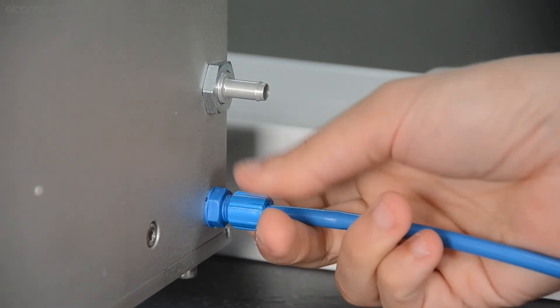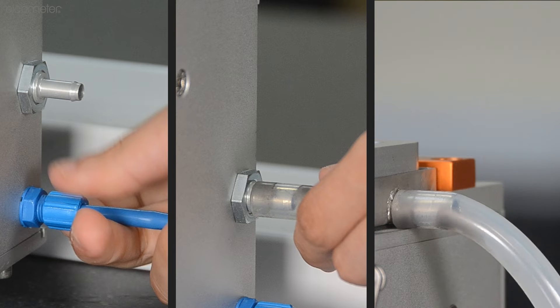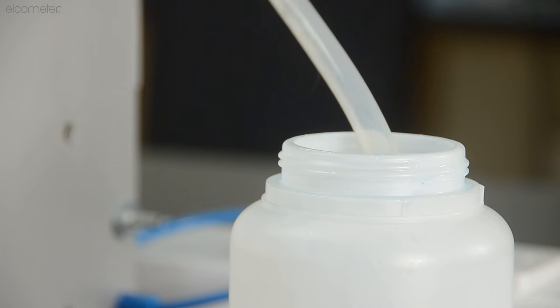Next, connect the drain pipes to the waste tubes also on the right side of the tester, placing the opposite ends into a container suitable for liquid waste.